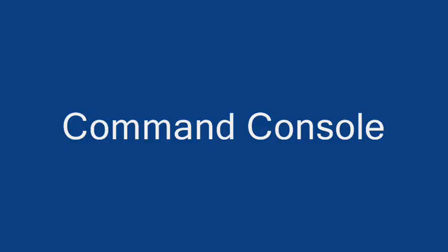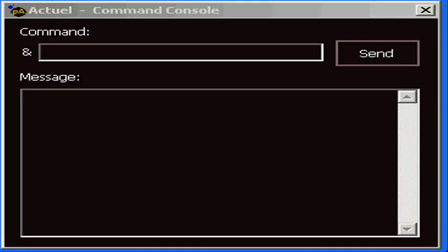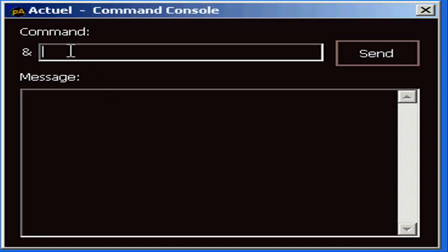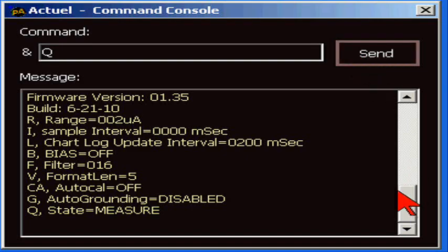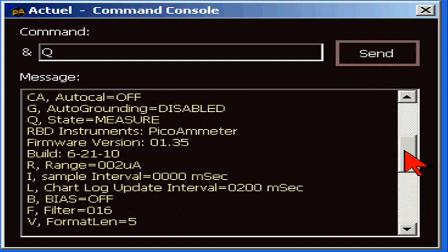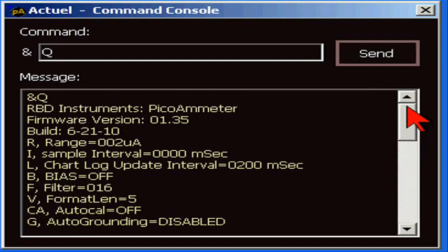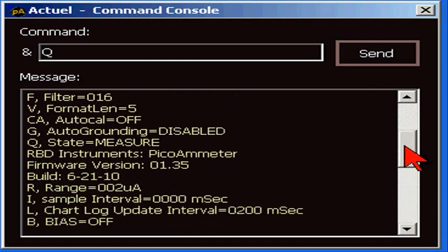Okay. Next, let's look at the command console. This dialog box is how you load ASCII commands to the 9103. We'll send the Q or query command, and the message box will display the results which include the firmware build date and how all the control parameters are set. A complete list of all ASCII commands is in the user's guide.